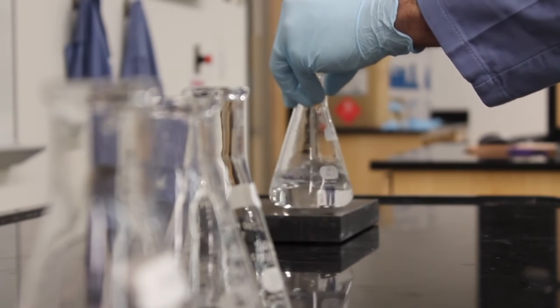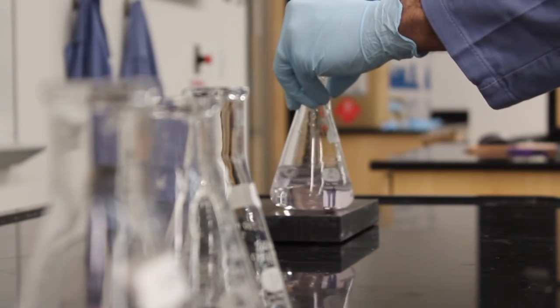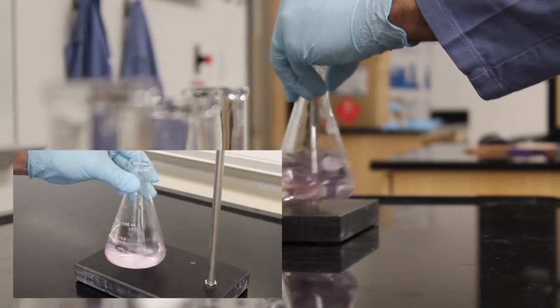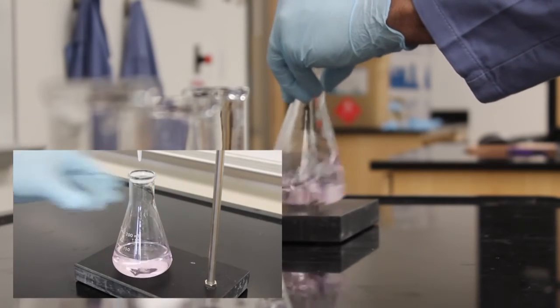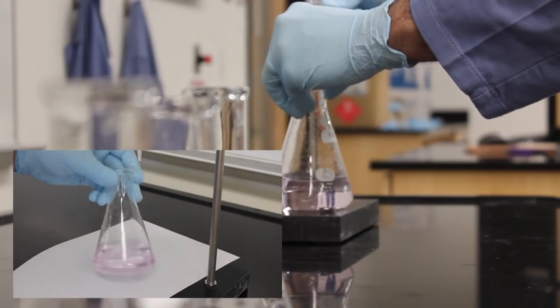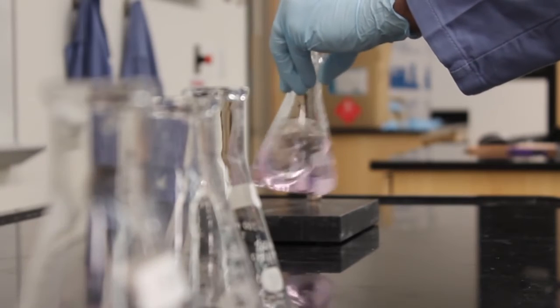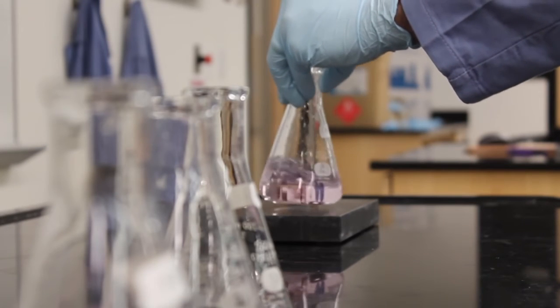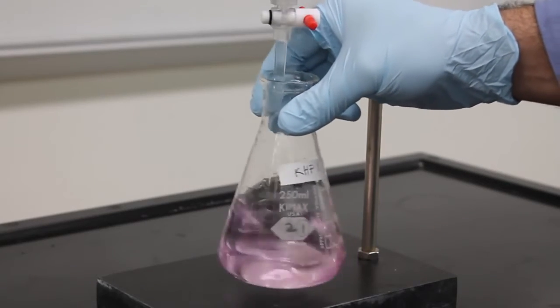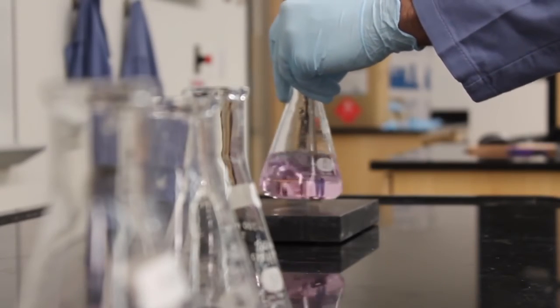Adding your titrant dropwise and stirring intermittently will ensure the best results. Adding a sheet of white paper under the flask can help you see the color change if the black background of the ring stand makes it difficult for you to see. A pale pink is the color that you are aiming for. You will need to titrate the rest of your solutions as well. I will speed up the process so it doesn't take so long. Remember, to get good results, this process does take some time.